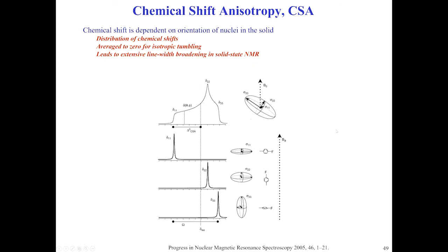And of course, in a given case, this is very useful information. Another interaction that was mentioned a little bit is chemical shift anisotropy. Chemists have trouble. I mean, when I had this slide of electrons jumping around a nucleus, it was spherical symmetry. Unfortunately, it's usually not. It's a tensor property. But when you look at a solution, isotropic tumbling averages this interaction to 0. But when you have oriented stuff or preferred orientations, here is a little example of fluorophenyl. You see the different orientations, a different element of the tensor will give a signal. And again, you can imagine they're not just 3, so the signal shape will come like that.